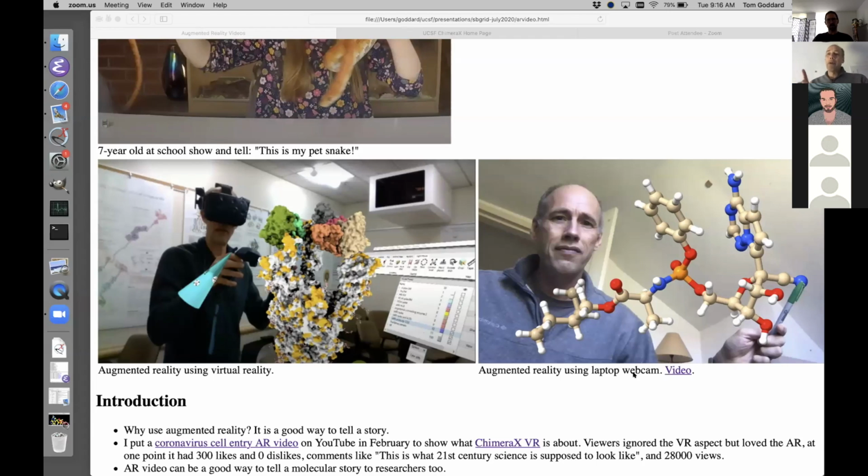But what I was doing just a couple days ago when I was practicing this is I would just click on the model panel in Chimera to hide and show models. But it was slower, and so I switched to using a VR button press. So I guess one question about the interface with VR is that a lot of the time the molecular graphics programs assume that you've got a keyboard in front of you. And it seems like if you're in VR with the 2 hand paddles, you don't have that.